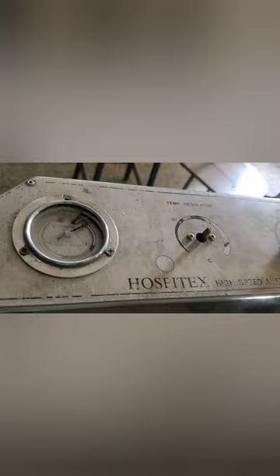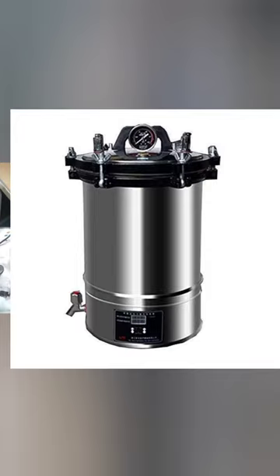Autoclave works with a combination of steam, pressure, and time, operating at a very high temperature under high pressure at a specific time to kill viruses, bacteria, etc. There are different forms of autoclave machine, as will be shown on the screen now.